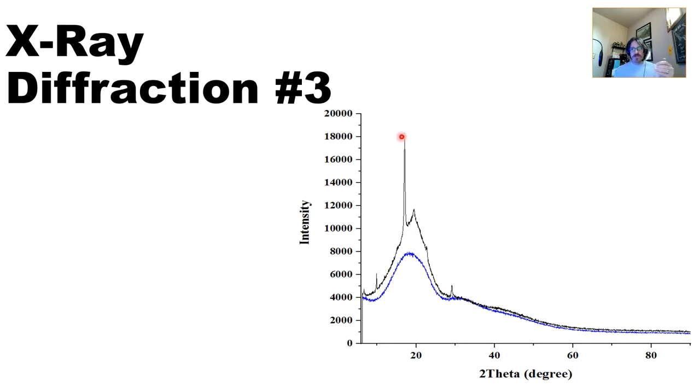If you see peaks like this, these count as reflections, and these reflections correspond with the dots that you saw in the other diffraction pattern at the beginning of lecture two. So for a visible diffraction pattern, we see spots. For a diffraction spectra, those spots are replaced by peaks, okay? And then you can actually calculate the d-spacing of these peaks as well.